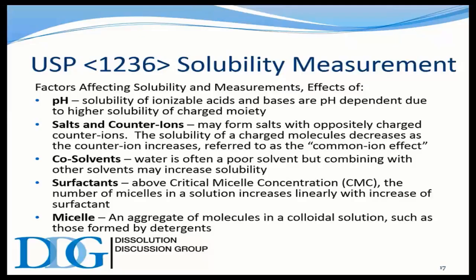Or you might see it with a coning problem as well, where drug is trapped underneath the cone in the bottom. And I think one of the biggest things, too, is if you take a veterinary aspirin tablet and try to put that in a 900 ml dissolution vessel, you'd probably reach an asymptote after about 20% dissolved, because it's saturated. You've approached saturation and the dissolution process has stopped. In any case, the asymptote is just where it's reached a plateau.